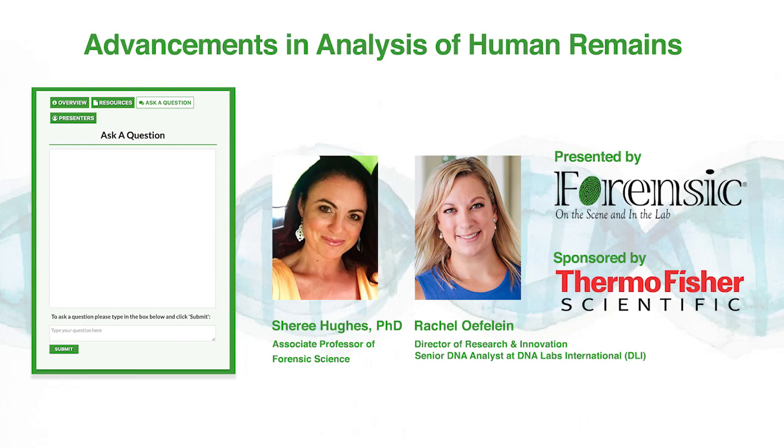So usually we ask for photographs, but then a lot of times you really have to physically see it in person. So we're looking for discoloration, how thick and how dense the bone is, if there's excess spongy bone. Those are things that are red flags for quality. When we're looking at teeth, we're trying to avoid any teeth that have cavities in them as well. Those can all be signs that you might have a little bit of difficulty with the bone.